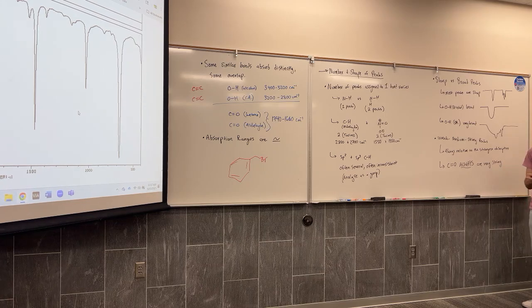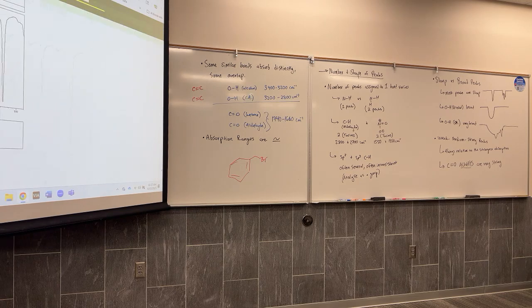They always absorb strongly. So when you have a CO double bond, it can be very beneficial to just start there. Look for a CO double bond. It shows up in a specific range, 1800 to 1700s range. Everything else in comparison is going to look smaller.